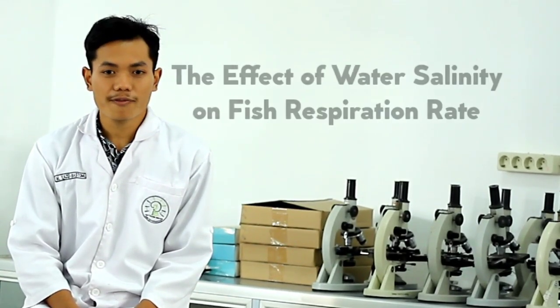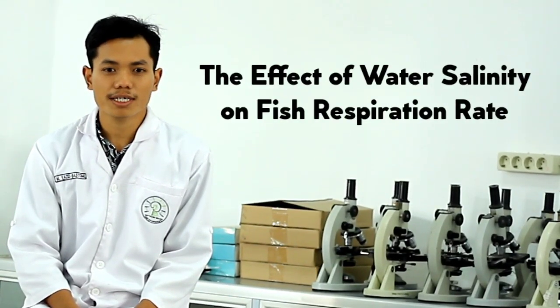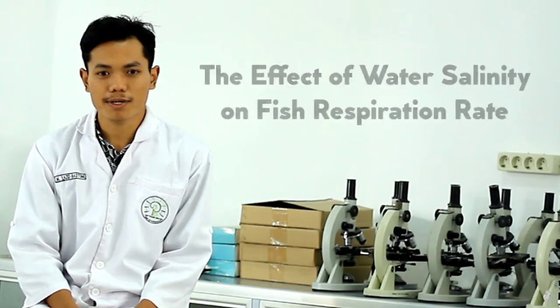Assalamualaikum warahmatullahi wabarakatuh. My name is Muhammad Yajid Bastomi. Here I will demonstrate a practical video. The topic is the effect of water salinity on fish respiration rate.